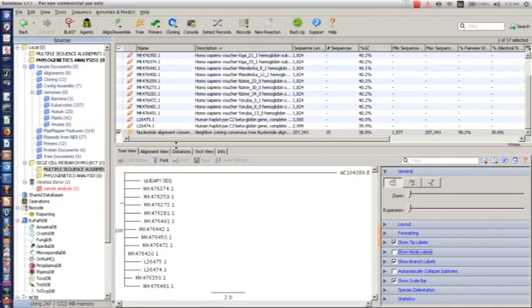And you remember that we're working on sickle cell, so that means the variations among all these sickle cell sequences are actually not much. They are highly similar, though they are all from different patients, but it's as if the rate at which the mutation occurs is in the same region. You understand? A mutational region that exists between all the sequences. So that's the essence of that.